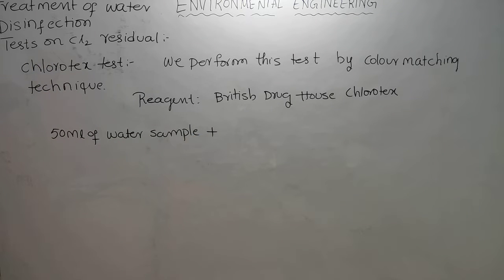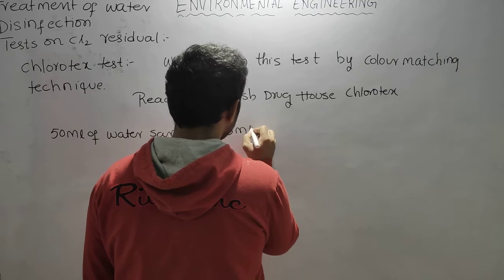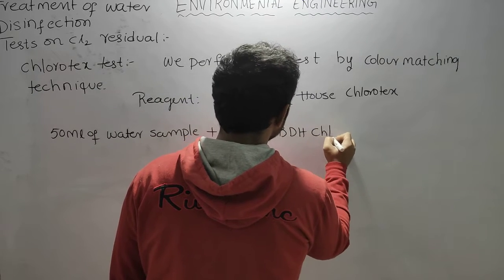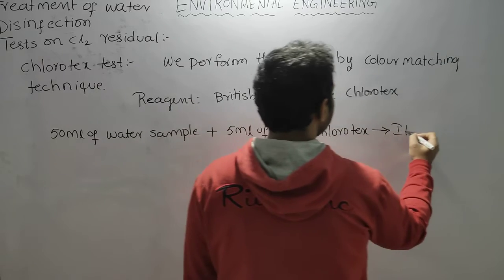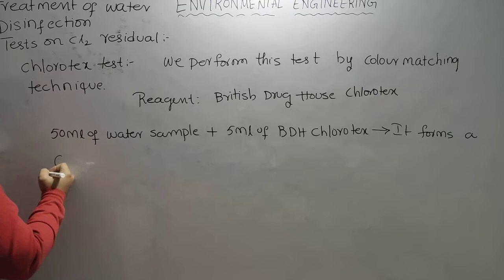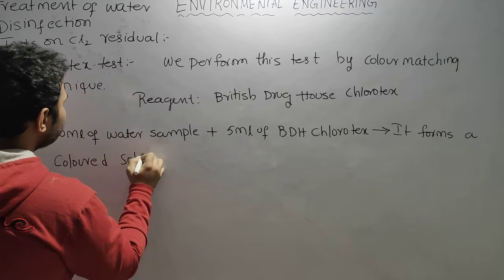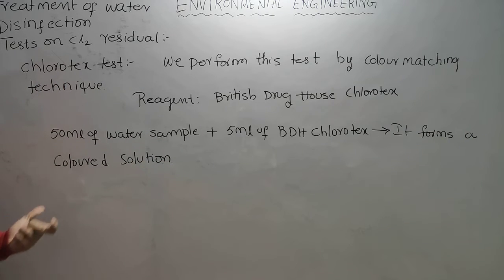Now it forms a colored solution, and we check the concentration of the color.